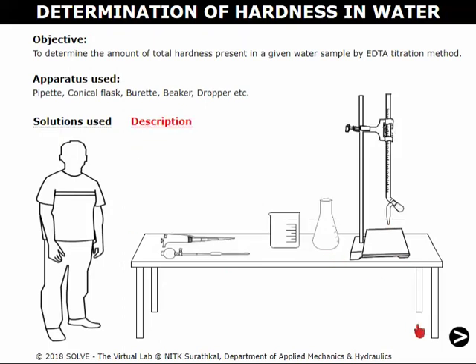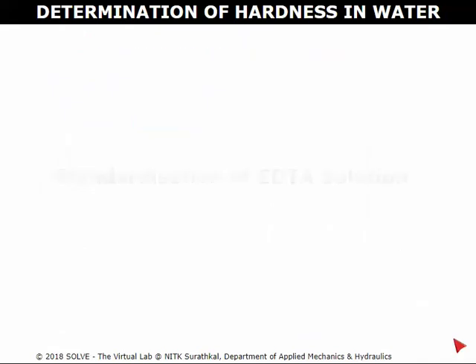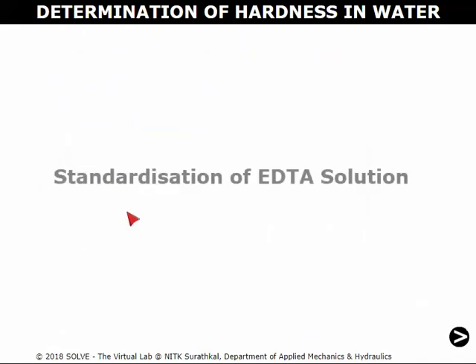Throughout the simulation, to proceed to the next step, click on this arrow shown below. Standardization of EDTA solution.